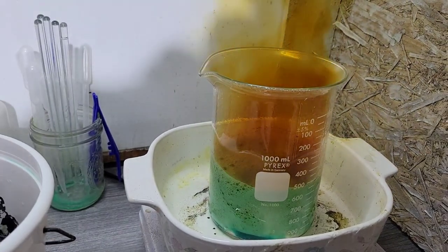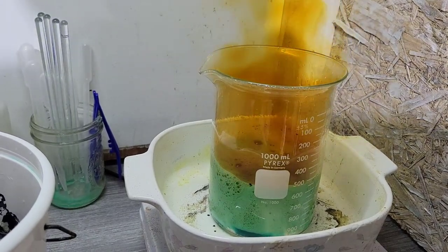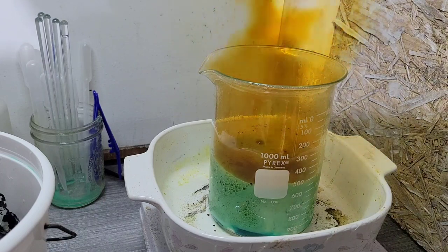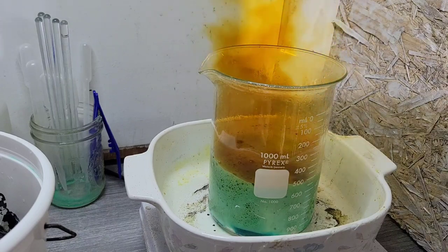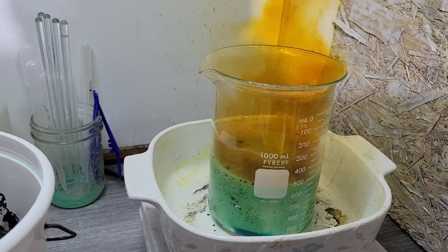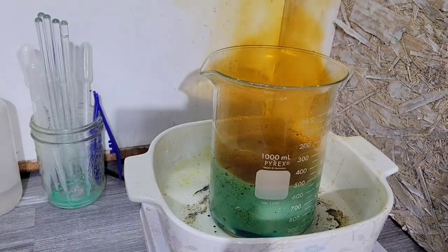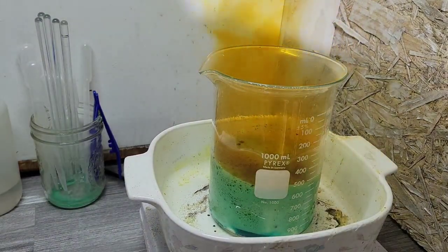Still got a pretty vigorous reaction. Still sitting at that 500 milliliter mark. It's not rising, so I'm not worried about it. But like I said, I'm not going to add any more until it starts to come down. Go ahead and put my bucket away.